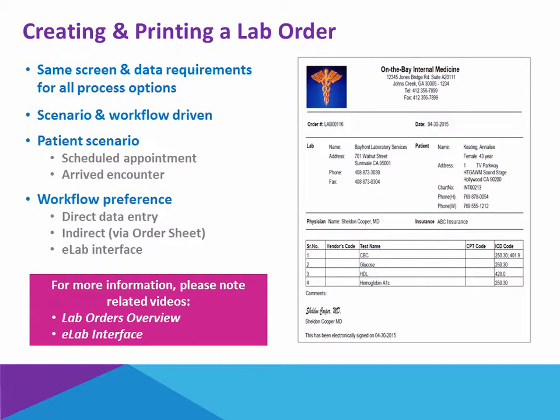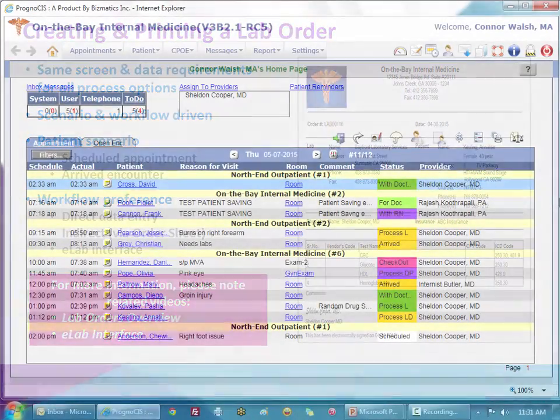Now, some related videos that cover some of these in more detail would be your lab orders overview and the eLab interface. But the focus of this video is simply creating and printing an order, and we are going to go through these different scenarios and workflows.